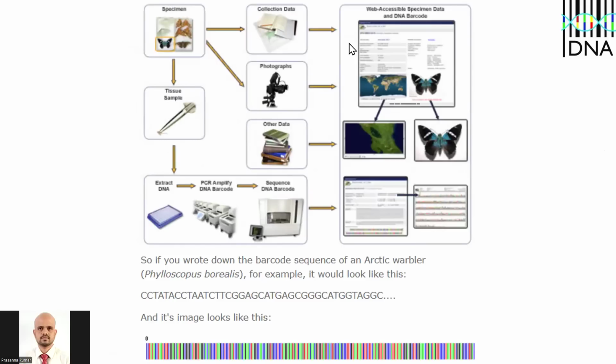Then I take all the metadata and subject the same specimen to DNA isolation and PCR amplification, where for a butterfly I will target the CO1 gene, using my CO1 primer. Even though the entire genome of the butterfly is extracted, the PCR is the bottleneck where we choose which gene to amplify. We amplify the target gene, and then subject it to DNA sequencing.